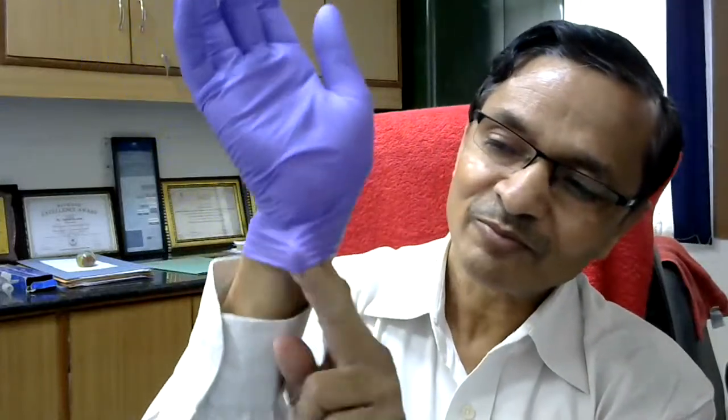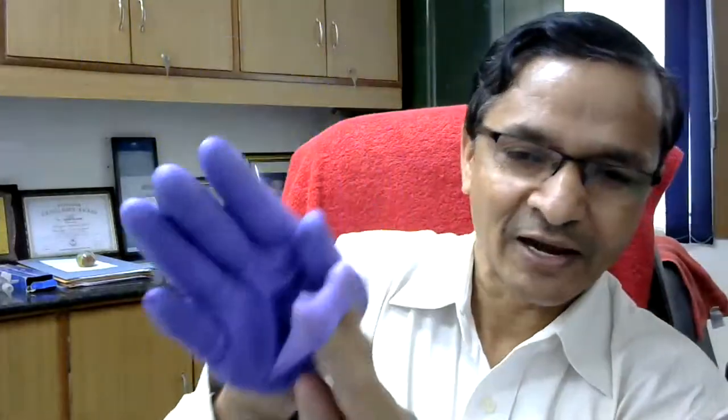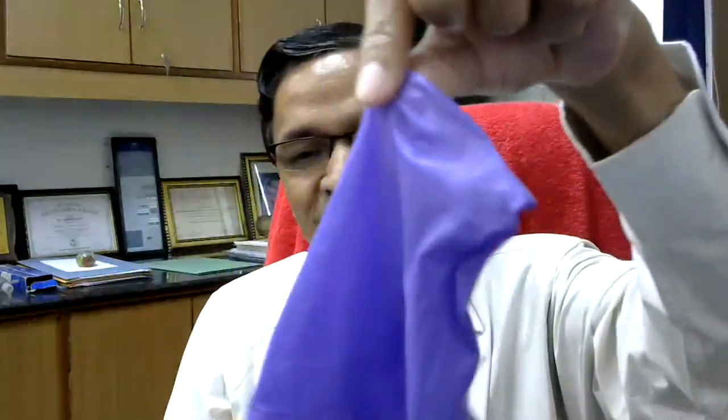So I put my hand like this and remove it, and you drop it into the dustbin. So remove without touching the outer side of the gloves. I have removed the gloves. Otherwise there is no use of wearing gloves if you are removing like this and like this, touching ethidium bromide.